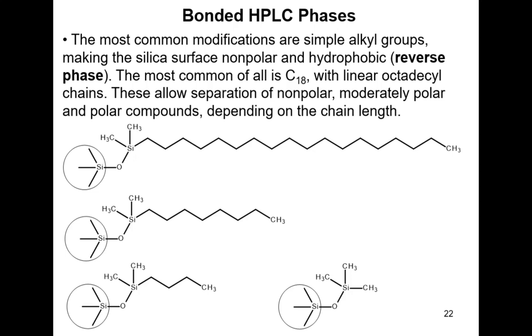And having hydrocarbon chains on the surface, that's obviously giving you a non-polar surface. And despite that, you might think that means that only non-polar compounds will interact with it, but quite a wide range of sample molecules will interact to some extent with this material.